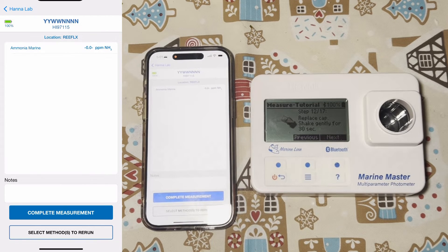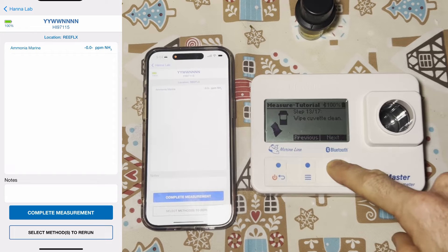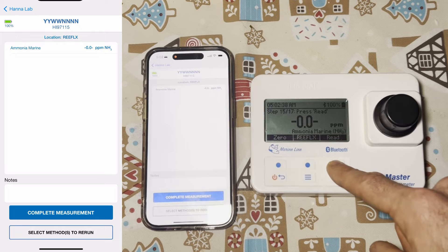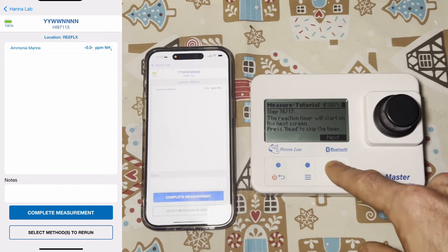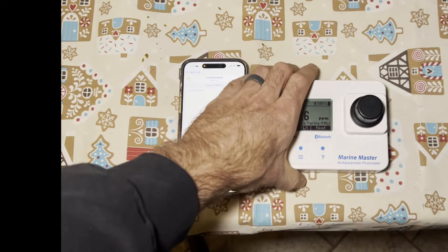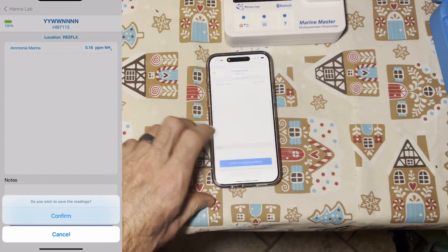Now it wants me to shake gently for 30 seconds. Wipe the cuvette clean, then enter the cuvette and check notch alignment. Now we're at the step where we are going to read it. This is going to start the reaction timer. My final ammonia result came to 0.16. From here we click complete measurement.